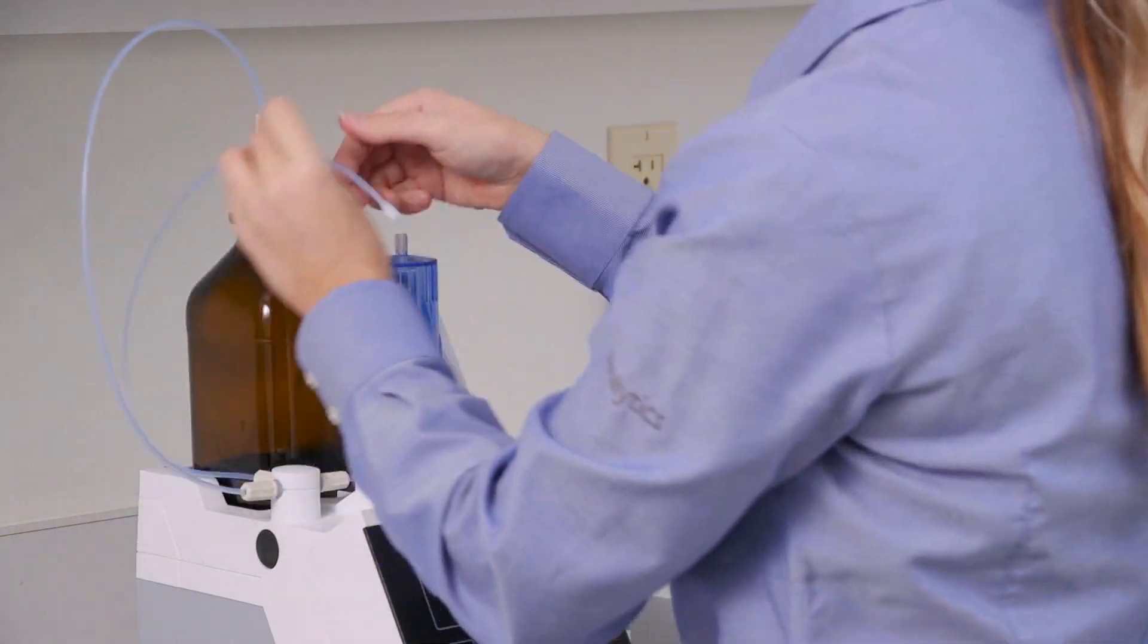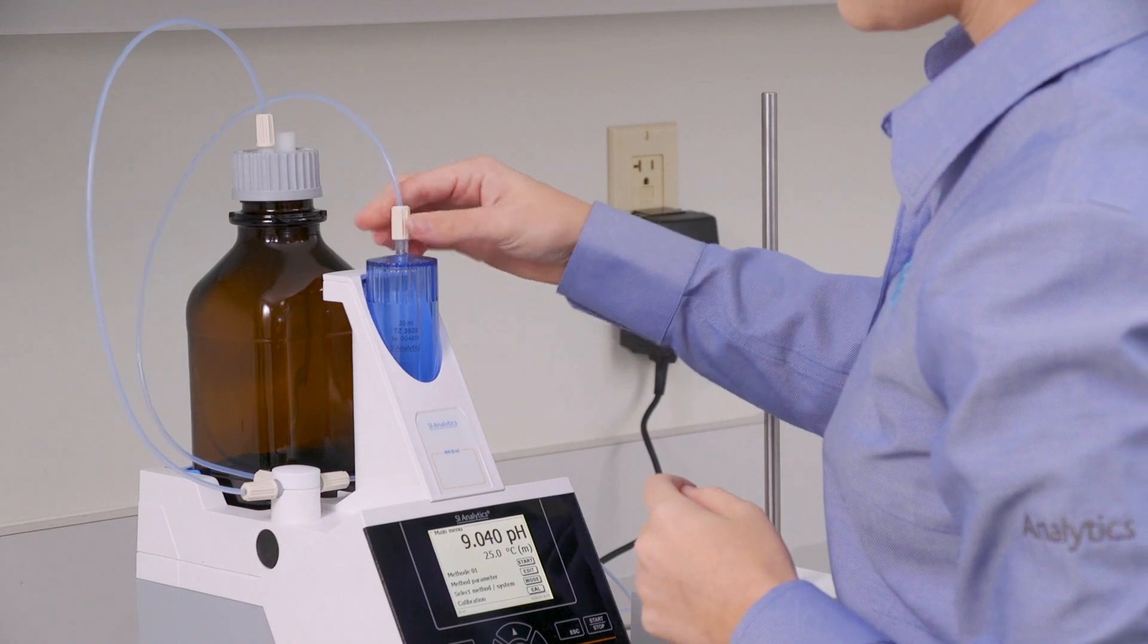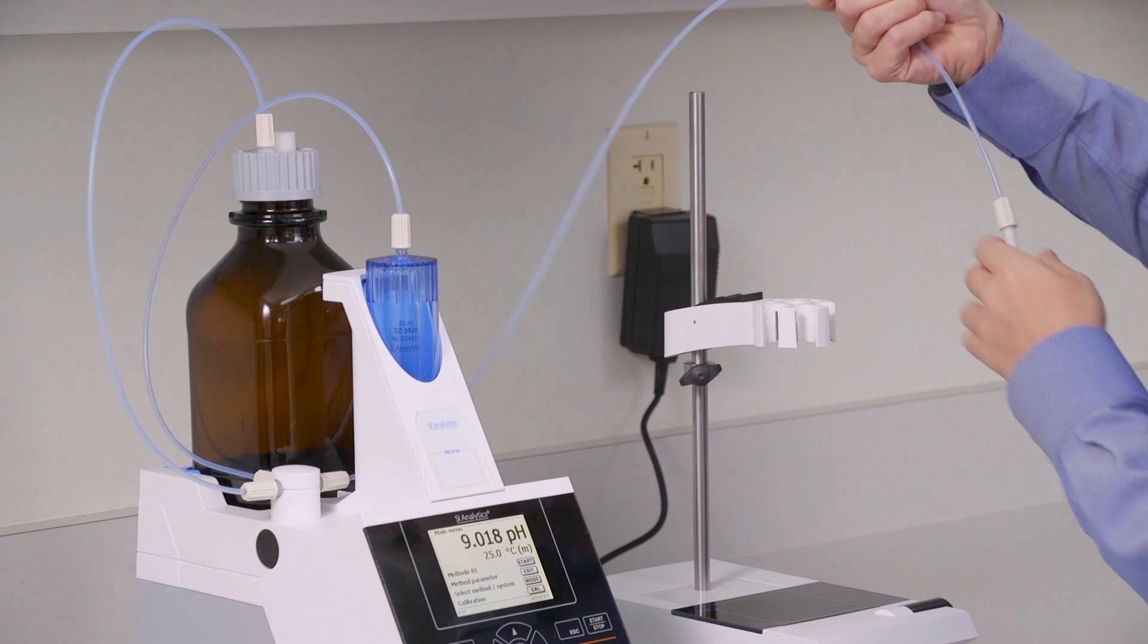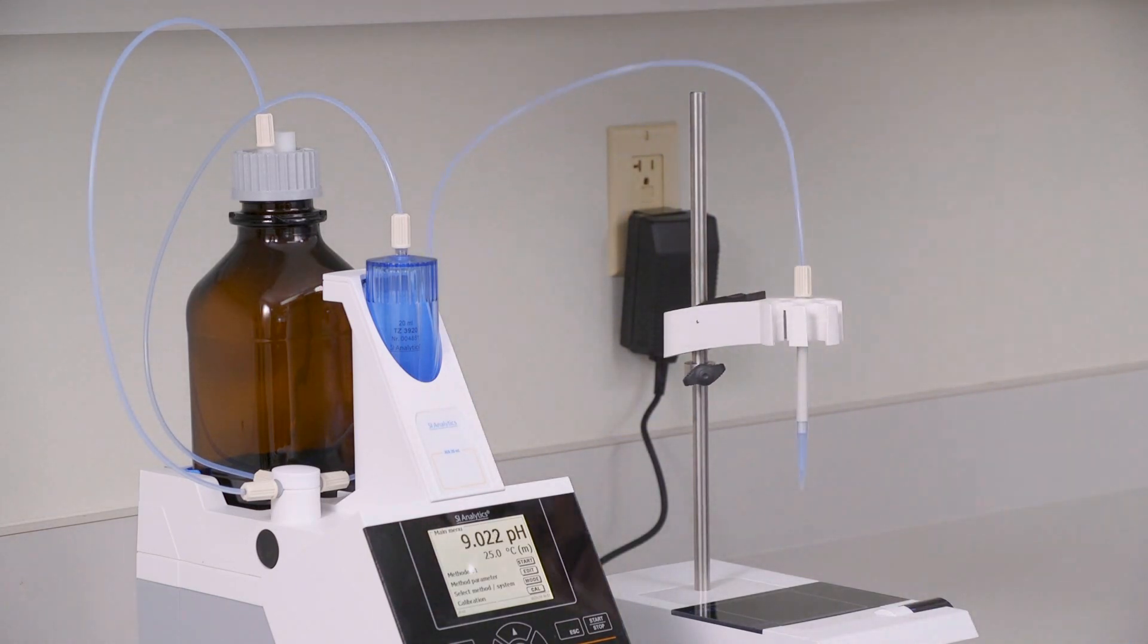You'll do the same for the other tube that goes from the back onto the top of the burette. And the last tube with the titrant tip will just go right on top of the titration clamp like that.